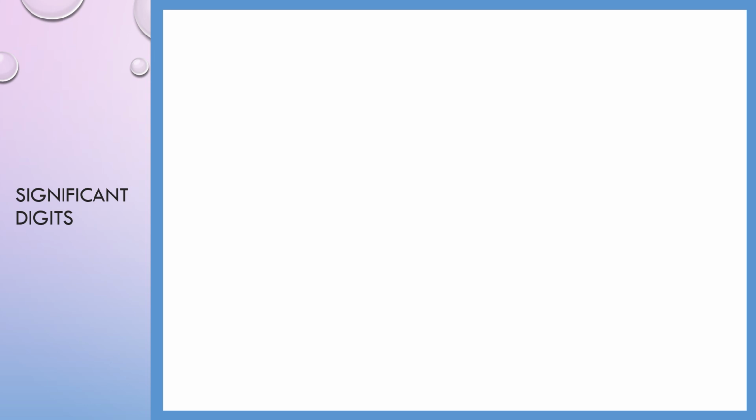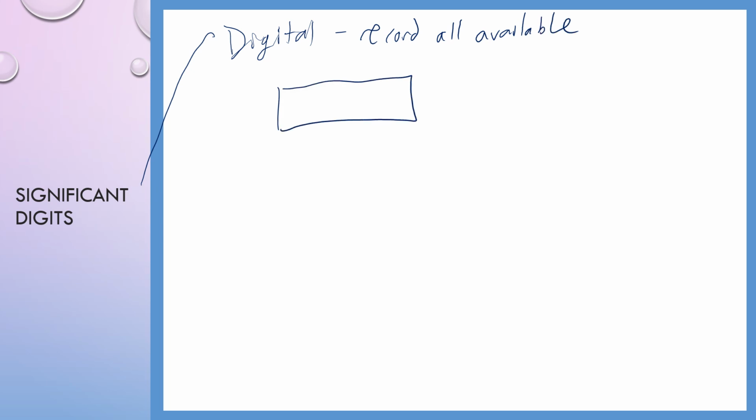So I want to take a minute to review significant digits, just in terms of how we record measurements. So if you were to have a digital measurement tool, you want to record all available digits. So if you have like a digital balance that goes to the hundredths place, let's say you have 9.37 grams showing up on your balance, you want to record that entire measurement.